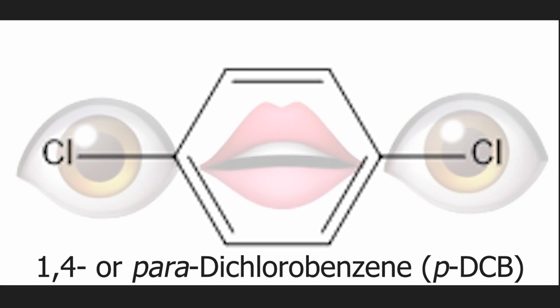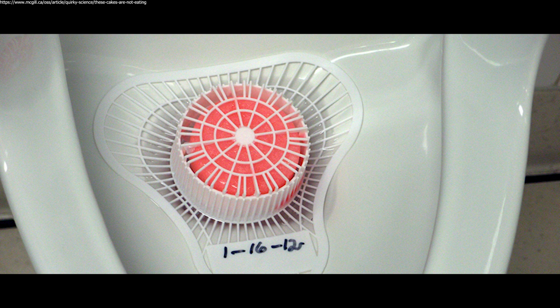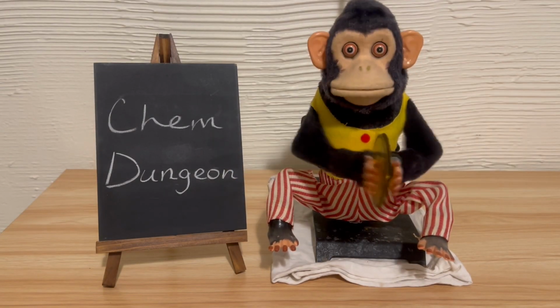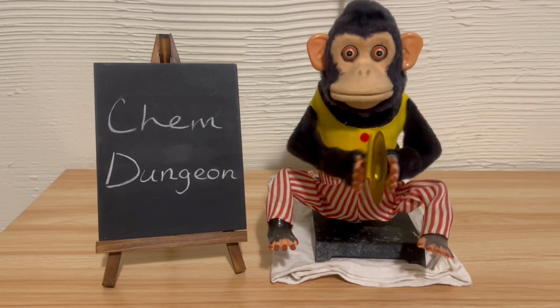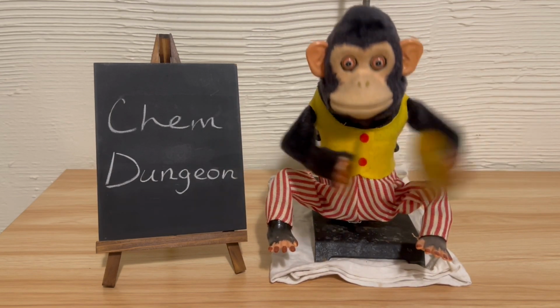I could have easily just bought it because it's very common, as it's used in urinal cakes as a deodorizer and a disinfectant. It's also used in mothballs as a replacement for the allegedly more flammable naphthalene, even though they're both fairly flammable. I decided to both synthesize it and buy it because the chemistry is worth exploring, but I don't know what the yields will be in the reactions I'll be using it for, so I don't want to run out, and it's super cheap. My benzene is also precious to me, so if I can avoid or minimize using it, I will.